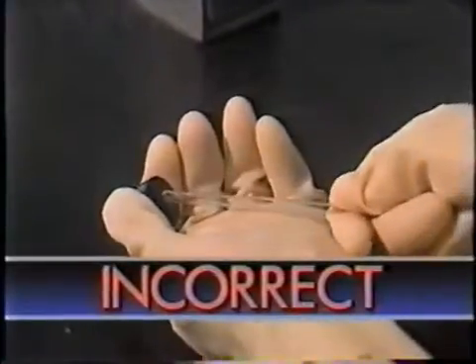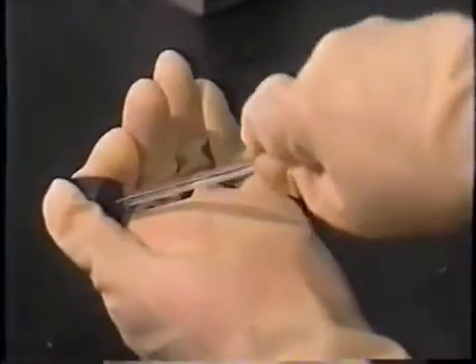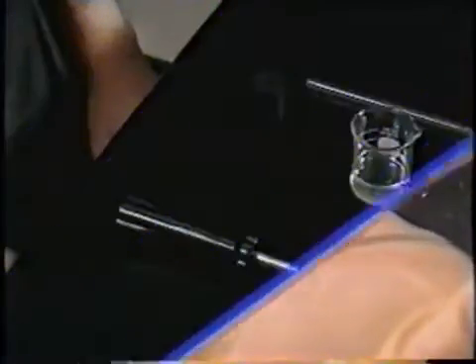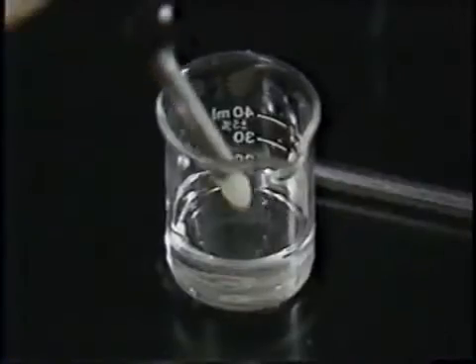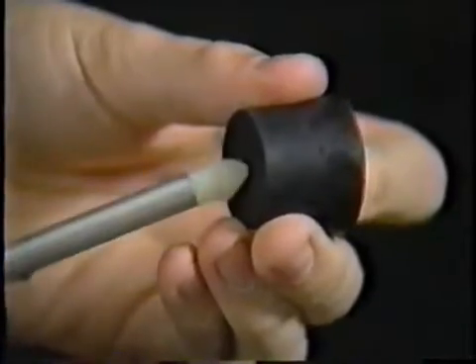The most common lab injuries are cuts from broken glass, especially glass tubing. A typical accident comes from using too much force to push a tube through the hole in a stopper. One way to avoid this kind of accident is to use an inserter. First, dip the teflon tip in a glass lubricant such as glycerin, then push it through the stopper.